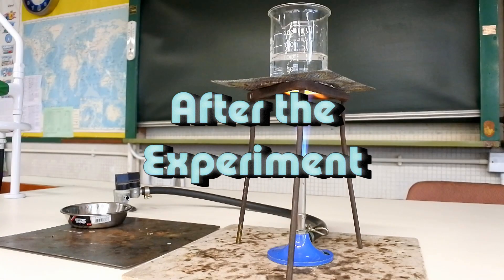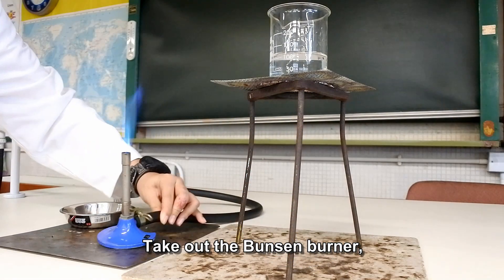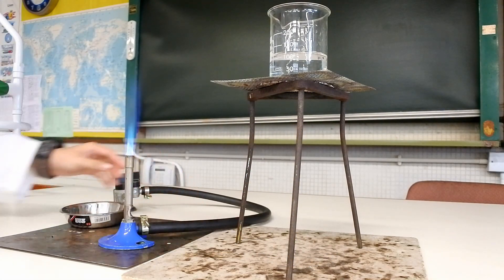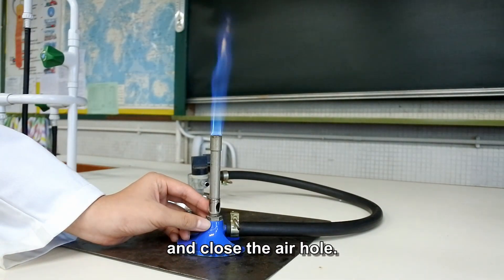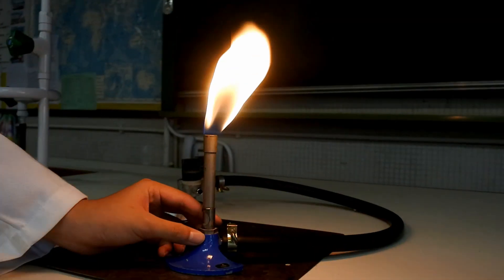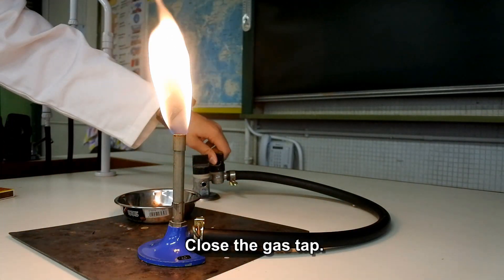After the experiment, take out the Bunsen burner and close the air hole. Close the gas tab.